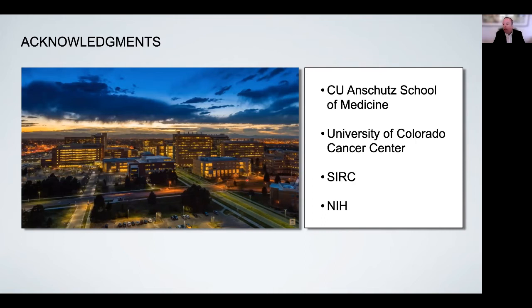Good morning, Natalie. Great to hear from you. Thank you for the great question. CryoEM is not a high throughput technique. And in order to answer your question, it's good to think about the two ways in which you can apply this type of approach. EM in stain is very straightforward. Basically, it takes about 5 minutes to prepare a specimen.